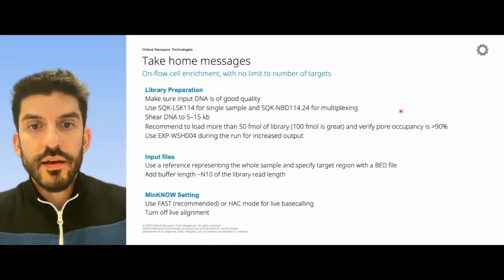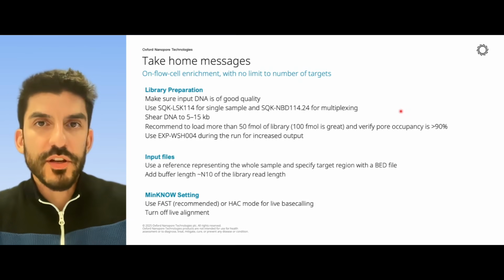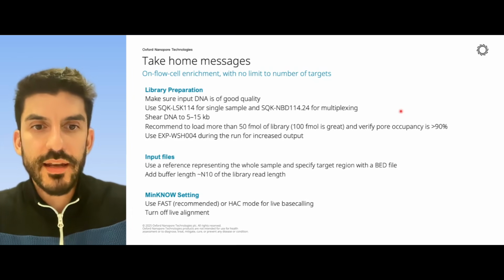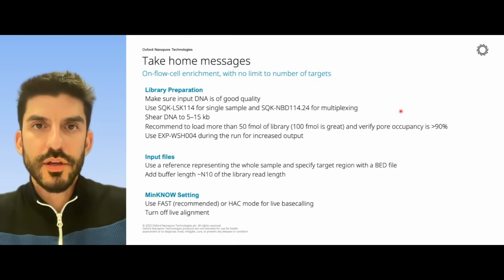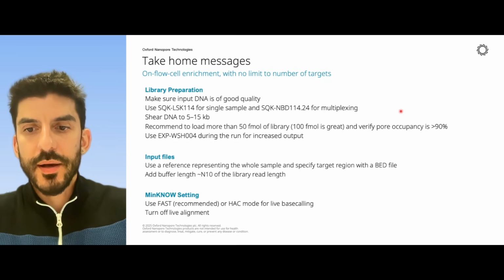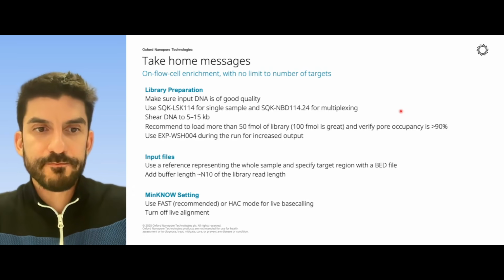And when it comes to base calling, please follow the community guidelines as we are constantly updating these. But in most devices nowadays, you should be able to keep up with live base calling in most conditions. If you're not sure, then fast is always a safe choice.